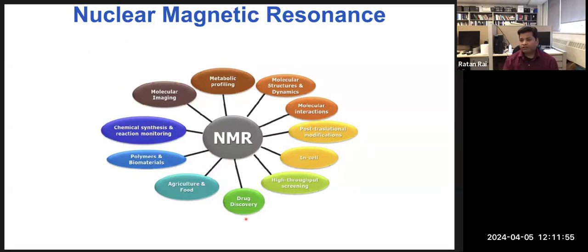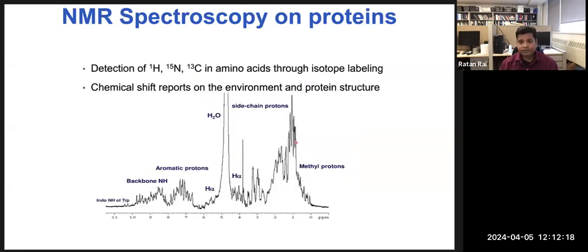It can provide the structure of a macromolecule in different environments, ranging from buffered solution to intact cell. It can provide insight into dynamic processes and allow us to monitor biomolecular interactions that are key to cellular responses to environmental, developmental, and growth signals. But in this talk, I'm going to focus on NMR spectroscopy in drug design and discovery. I realize that you may not know about NMR spectroscopy, so I will give you a brief description. If you have any question or doubt, or anything I show which you don't understand, please just ask at any time.